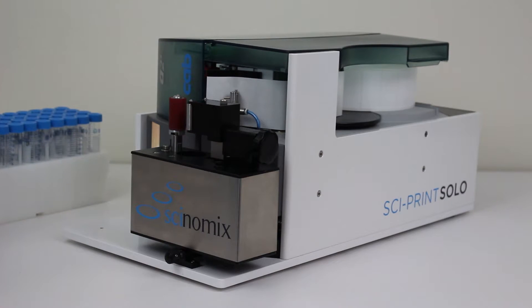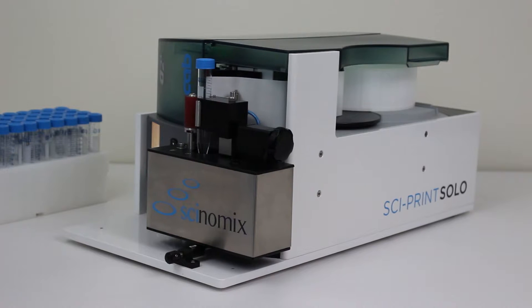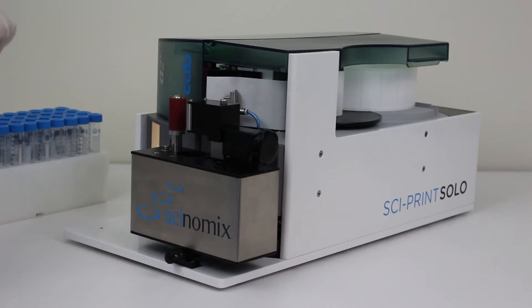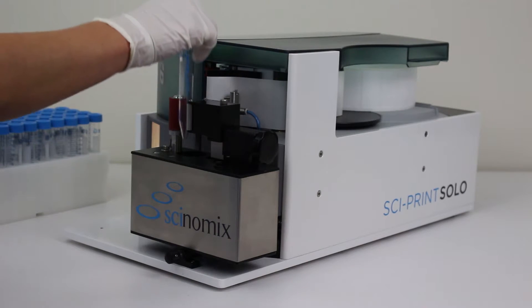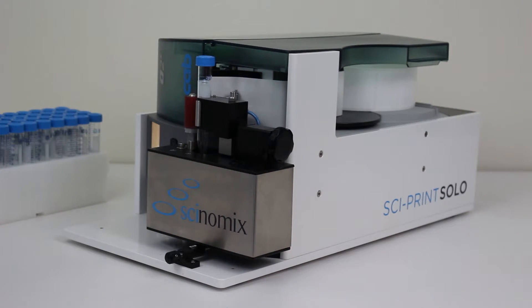For working with smaller quantities of tubes, Synomics offers a semi-automated vial labeler, the SciPrint Solo. The system is used for manual labeling of tubes ranging from 0.5 milliliters to 50 milliliters. The SciPrint Solo is commonly integrated into larger automated systems such as the TCAN EVO.